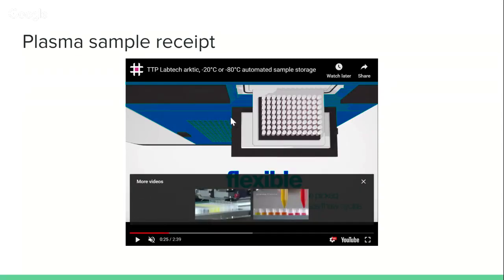Importantly, the machine has this tray of a certain number of tubes in a certain configuration that you can feed tubes in, and then when you want to get tubes out, you just give a list to the machine, pretty much as a vending machine. You say, I want this chocolate bar, or I want this drink. The same, you give a list to the machine and say, out of the thousands or hundreds of thousands of tubes that the machine has stored, please give me exactly these 96 tubes that I now want. You give it an empty rack and the machine will give you the tubes.